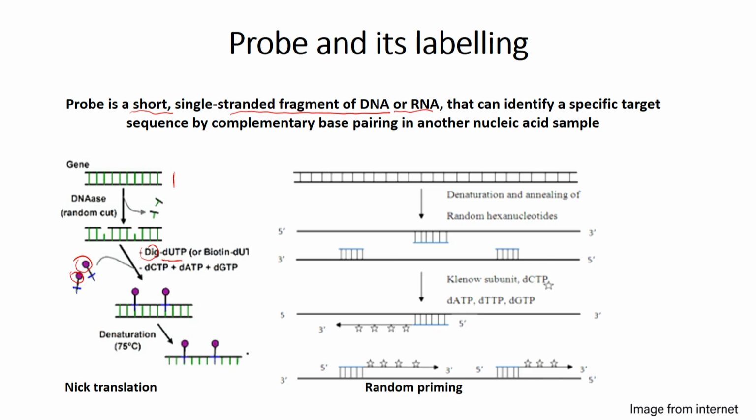So, this will polymerize. While doing this polymerization, this labeled deoxyribonucleotide is being taken and thus the probe is labeled. So, now the probe is ready.